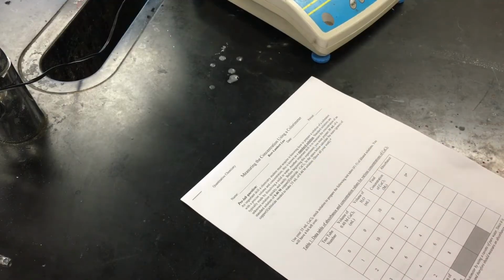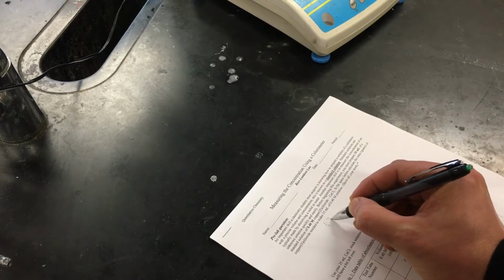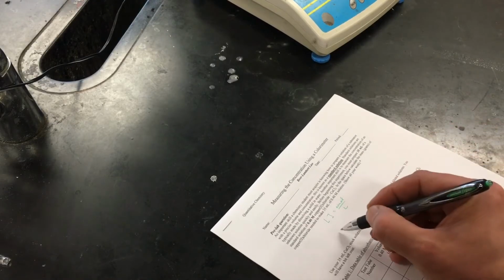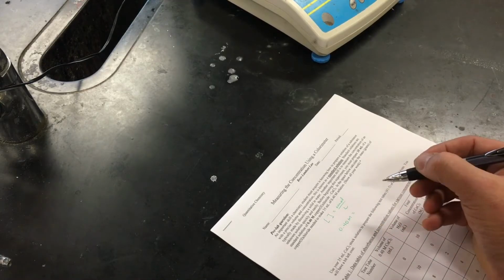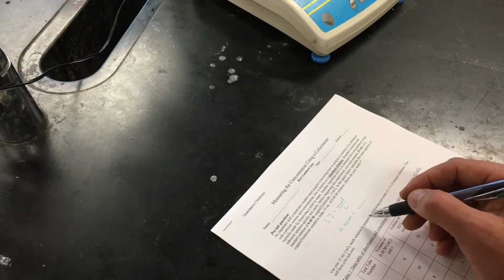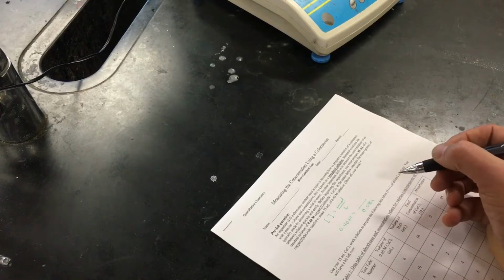So the very first thing we need to do is to figure out how much copper chloride to weigh. We know that the concentration is equal to the moles per liter. And in this problem, we have the concentration at 0.40 molar, and we have the volume at 35 milliliters. And so we need to convert the 35 milliliters to liters. So we divide by 1,000 and we get 0.035 liters.